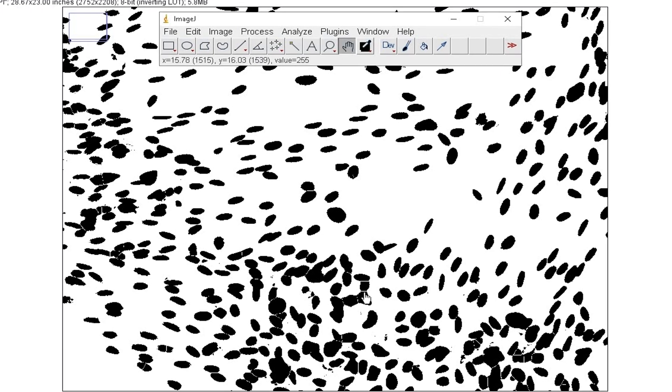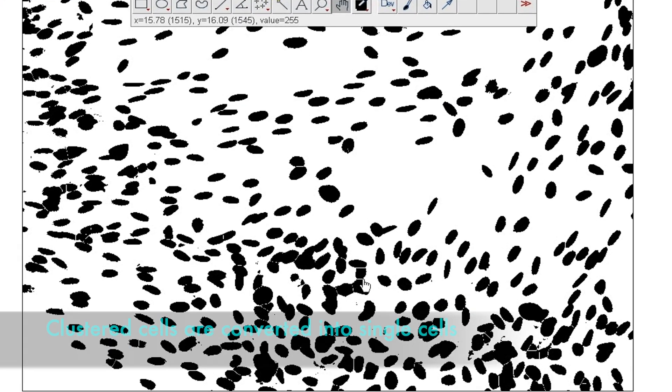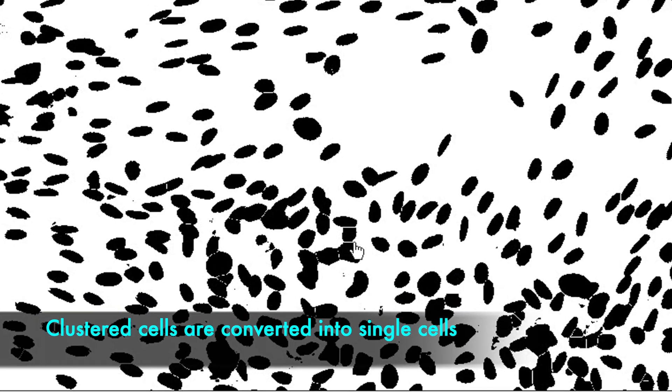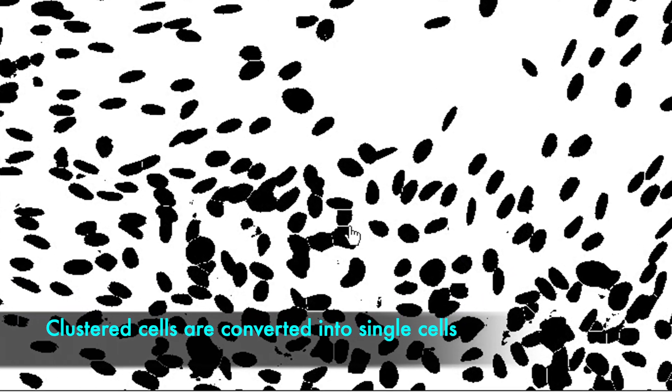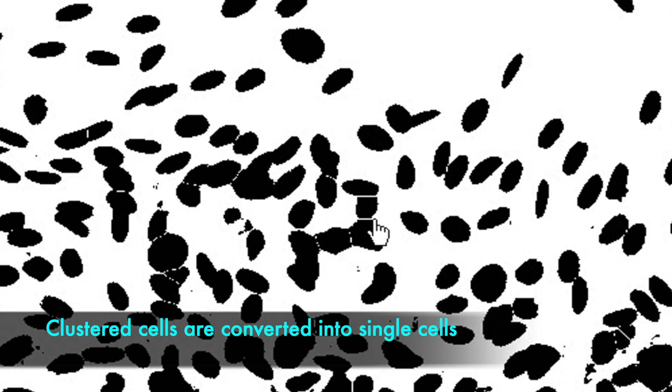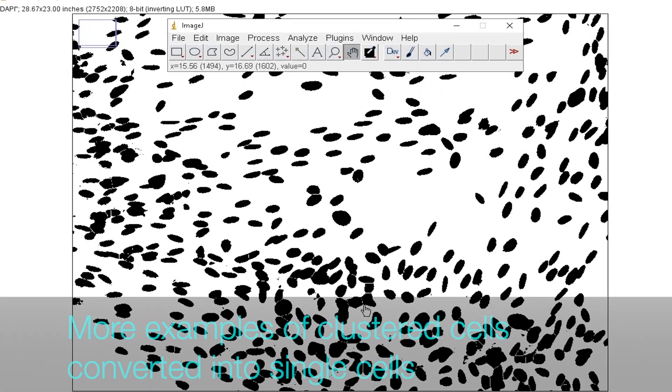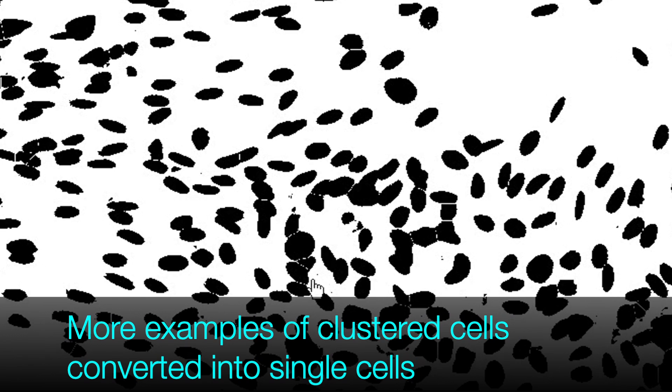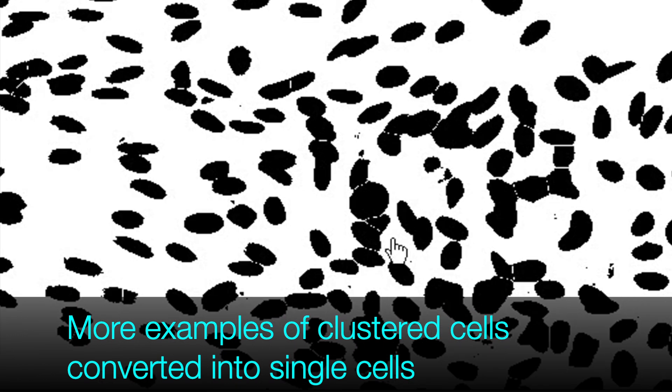Now, the clustered cells are converted into individual cells. For example, in this group of cells, white lines have been created by watersheding that splits the cells and separate from one another. Similarly, the rest of the clustered cells are also separated.